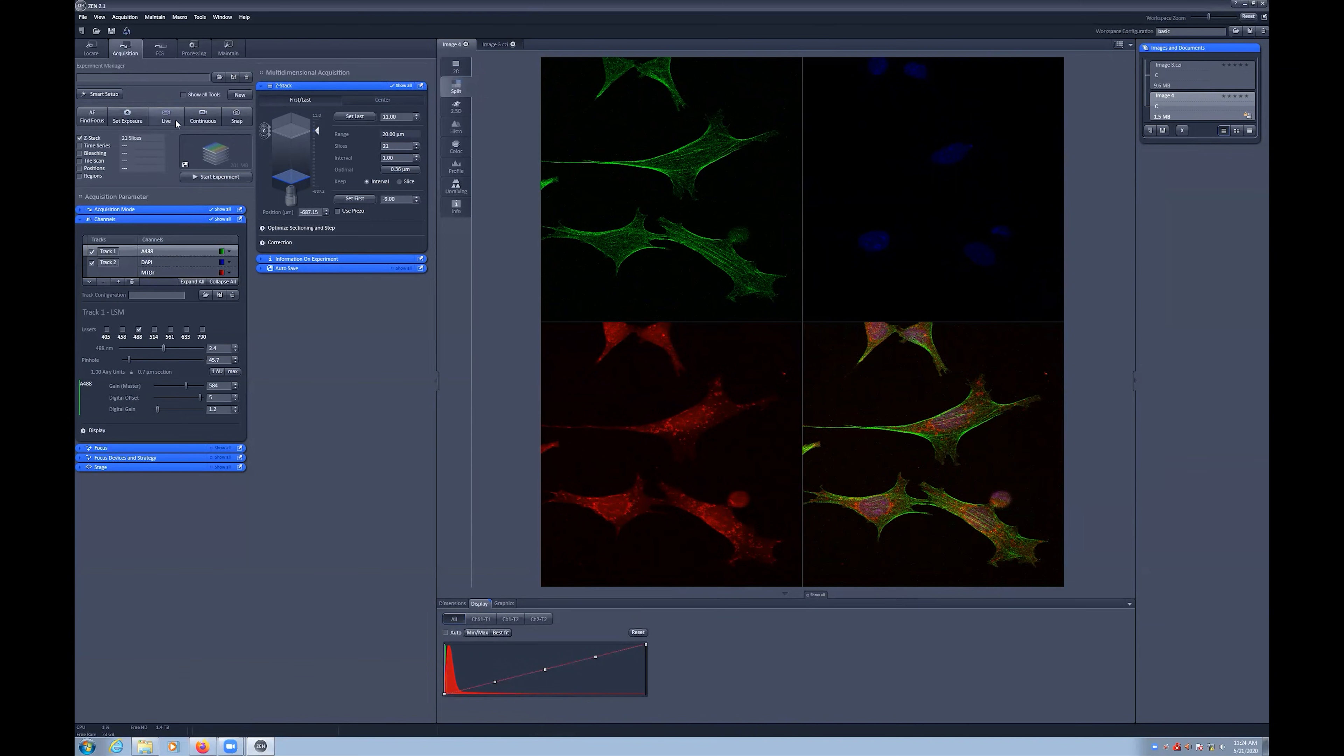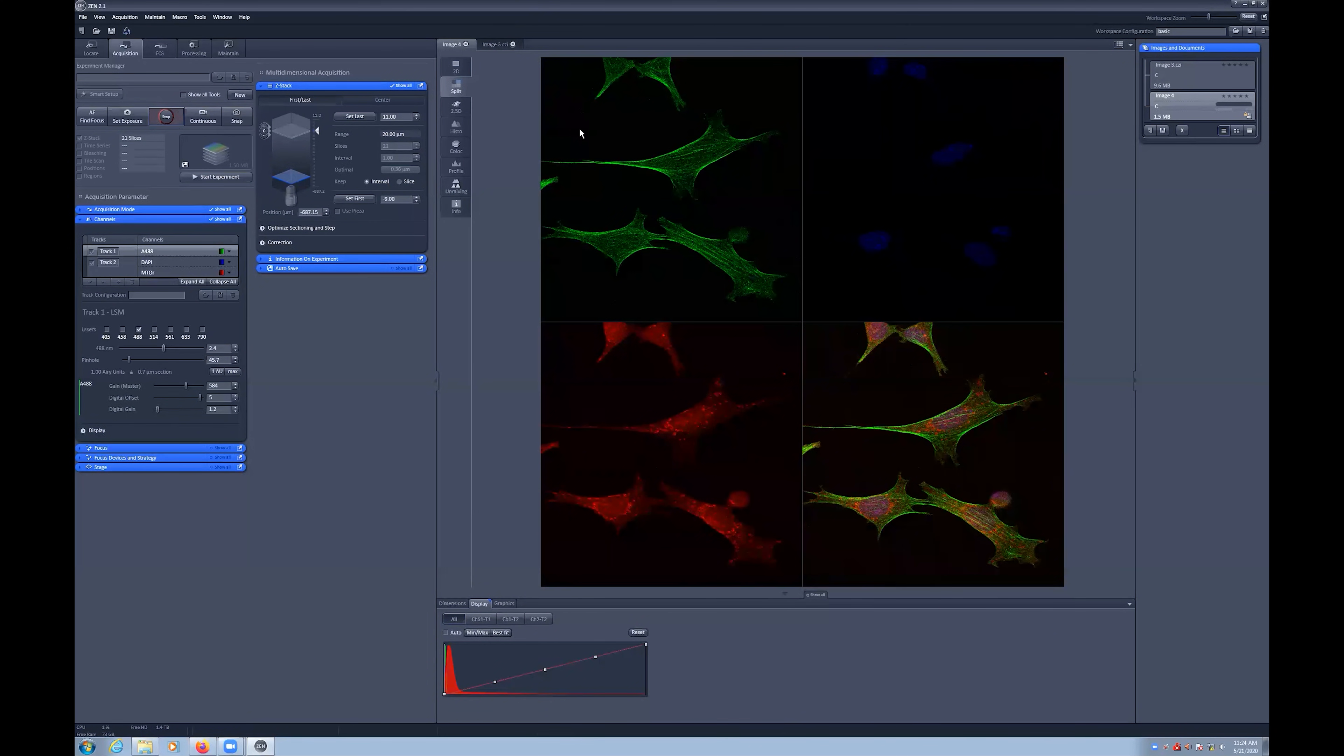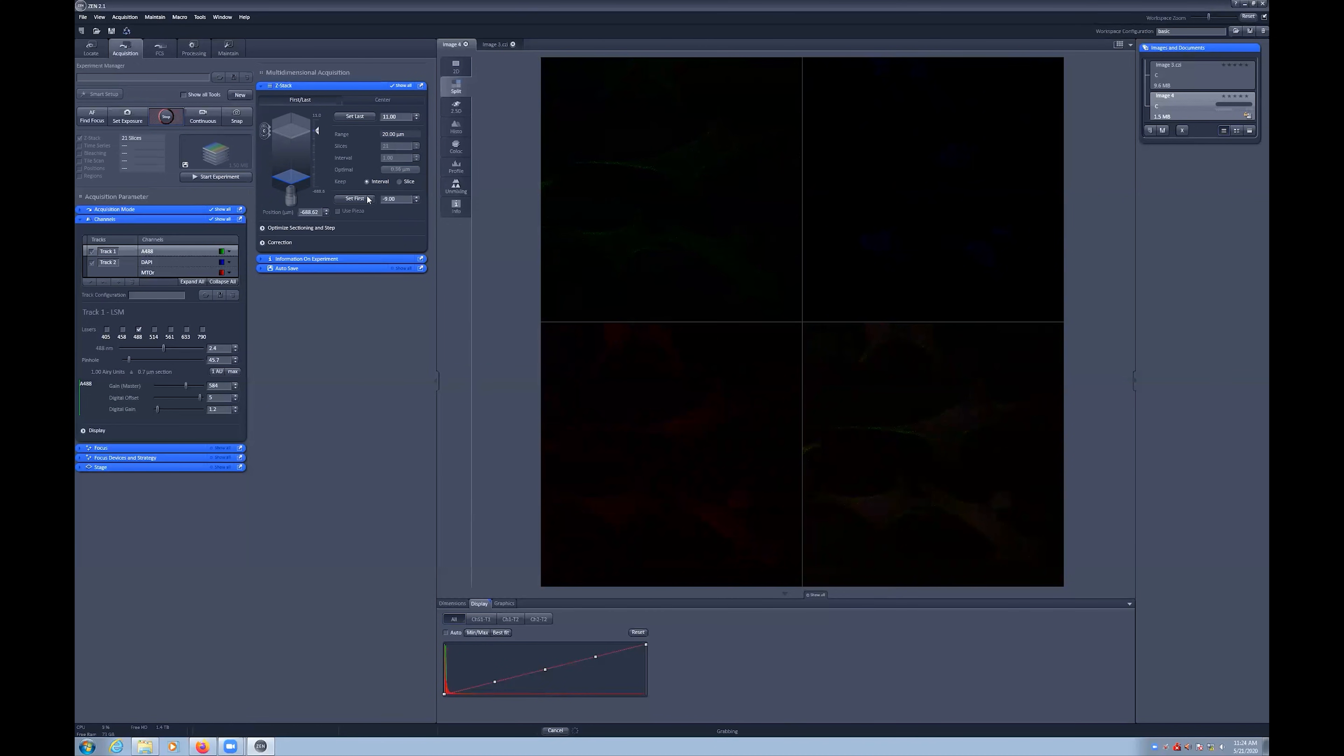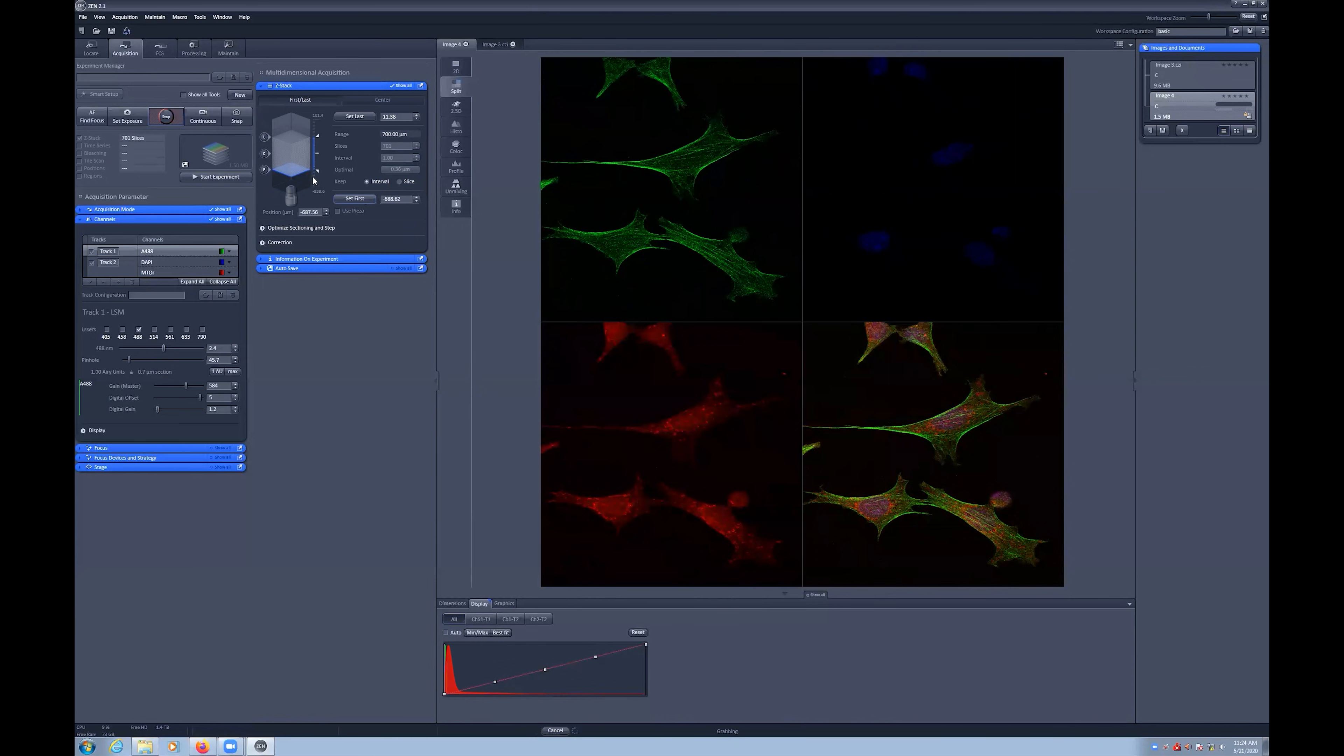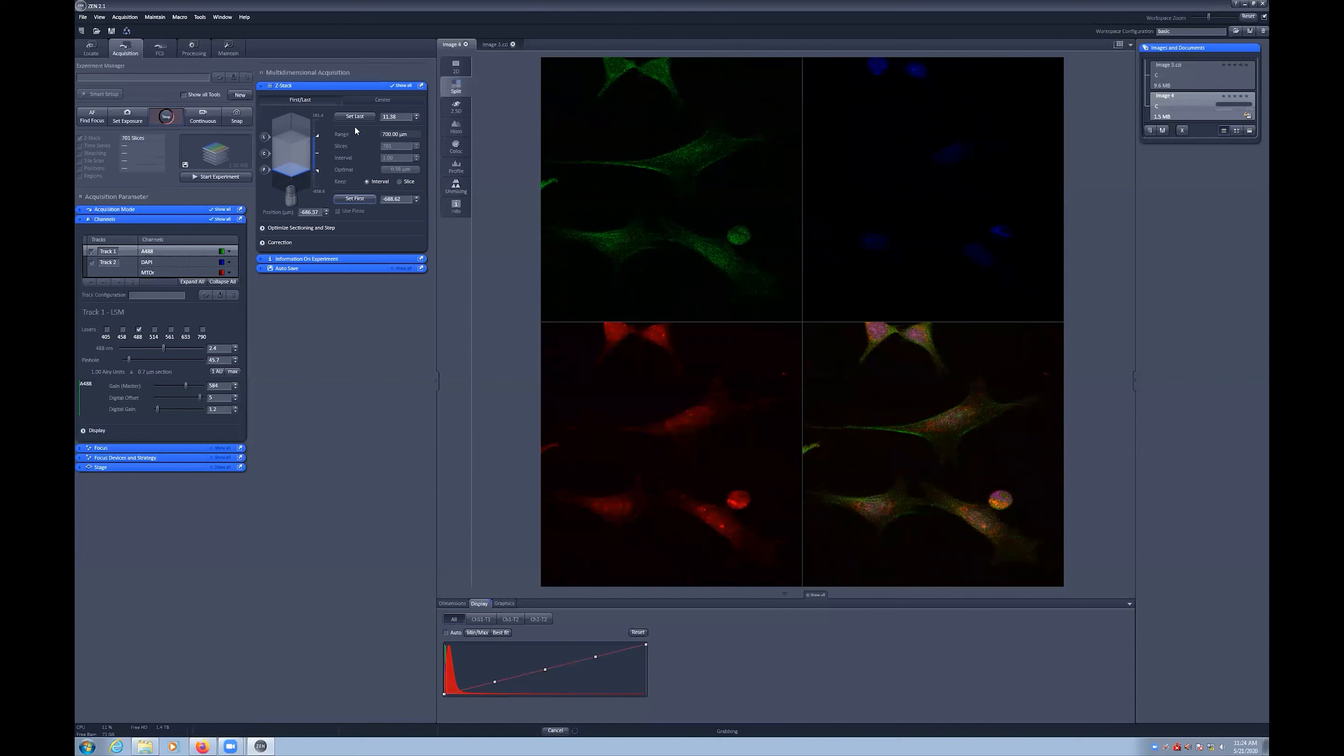Begin by turning on a live scan and adjust the focus wheel to the top and bottom of your sample. When at the base of your sample, select Set First button, and then adjust focus to the top of your sample and select the Set Last button.